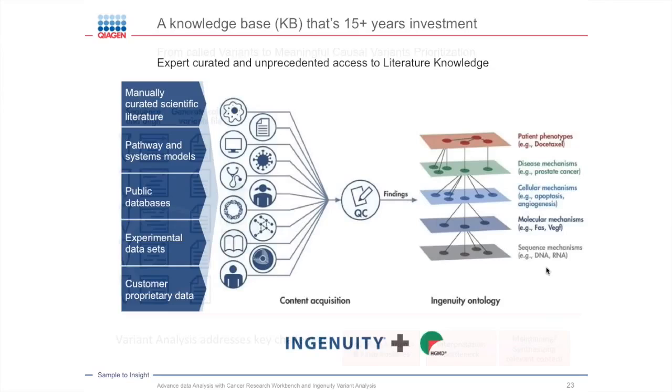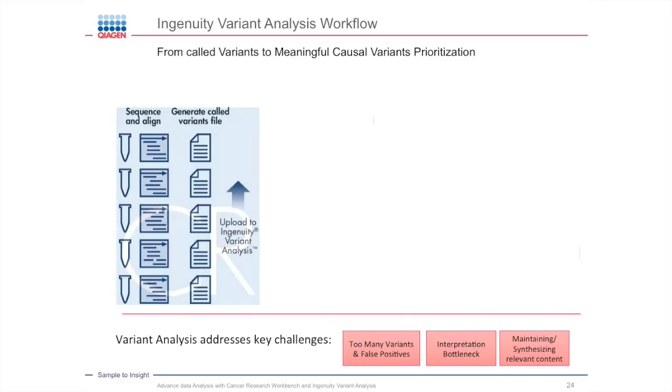And the way we will do that is, in the Cancer Workbench, you do your sequence, you align your variant, you call your variant. So the Cancer Workbench would do that. And Variant Analysis will take the information at this step.